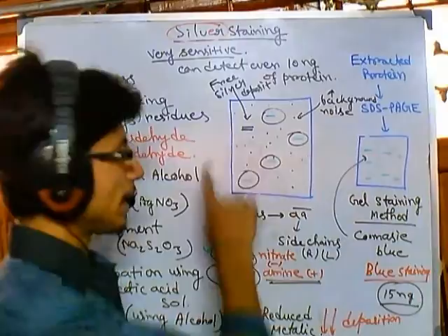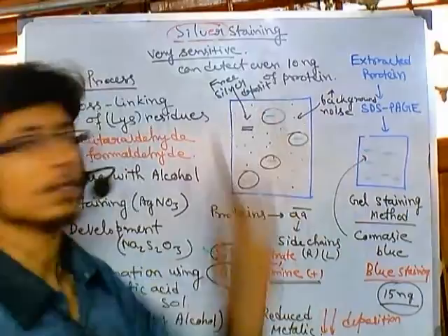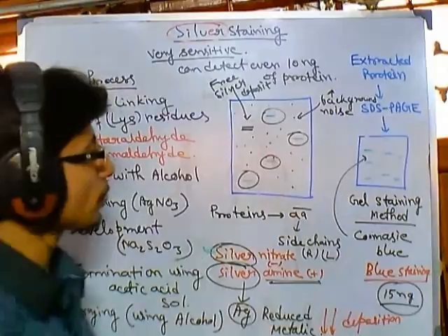Now suppose you need to run the gel, separate proteins, and then take these proteins for mass spectrometric analysis. You cannot do it if you stain this gel using silver staining. So if you are trying to analyze your protein using mass spec or MS analysis, you must not go for silver staining. You can go for silver staining in another gel, which can be degraded after silver staining. Okay, so this is the whole process of how it is obtained, and I hope this is helpful. Thank you.